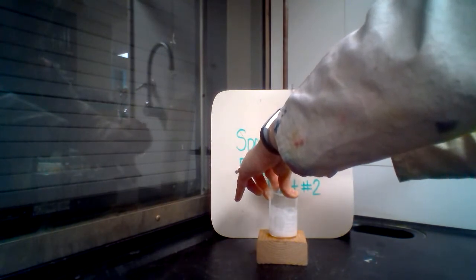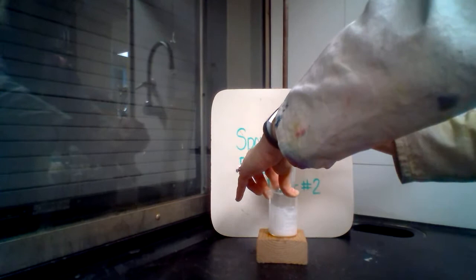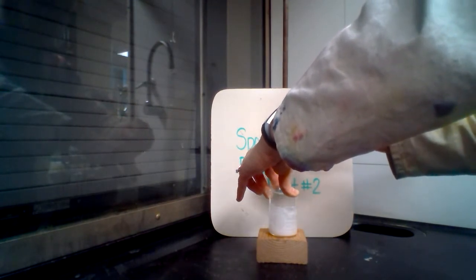Keep stirring a little bit more to get all of the solid pieces broken down.